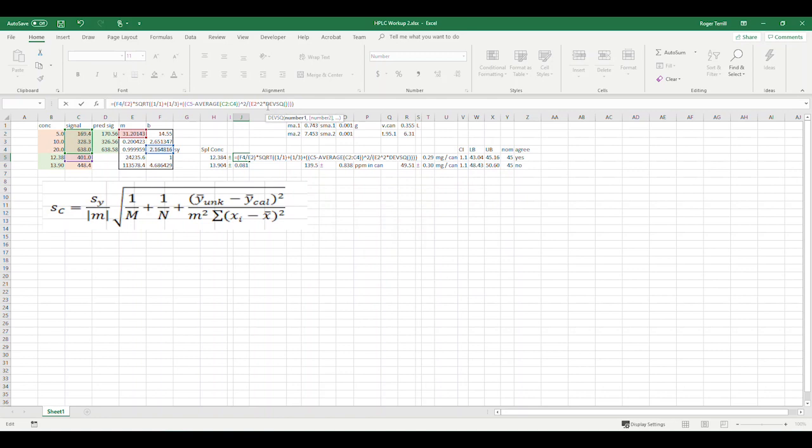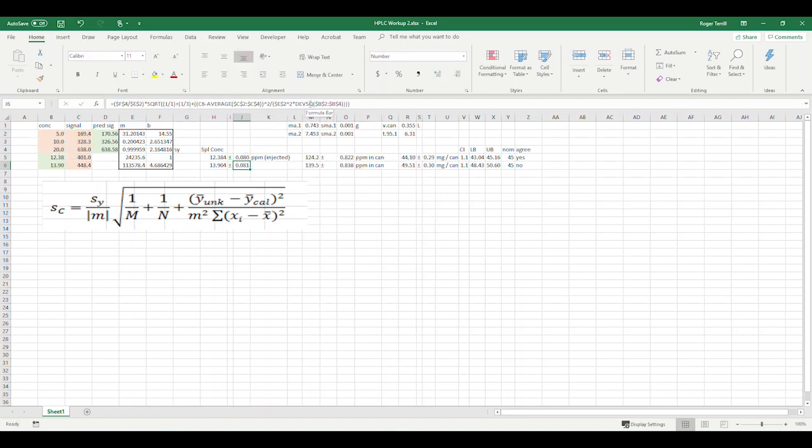I'm just going to sneak up on in there. Sometimes it throws an error when you do that, but just ignore that error. Right? And this should do it. There we go, that's 0.080, right?